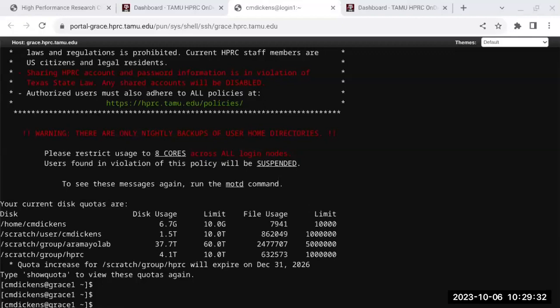So what Purge Haplotigs does is it takes the largest contigs, and these are called the primary contigs. So for example, you've sequenced the entire, let's just say chromosome 1, and you've got eight regions assembled for chromosome 1. 5 of those are actually the primary contig, and 3 are the homologous chromosome.